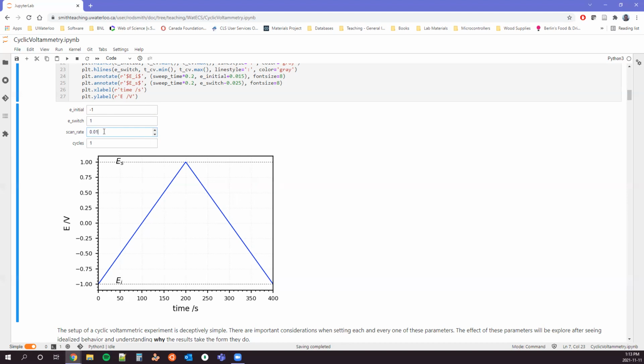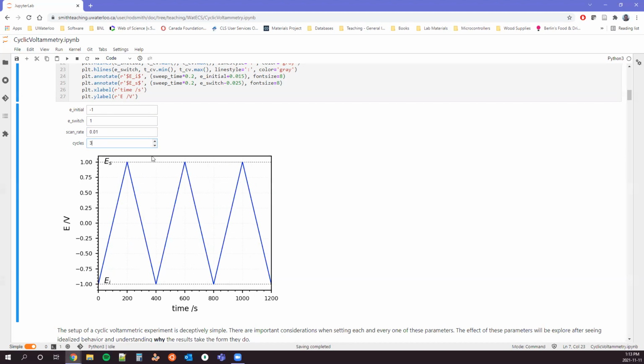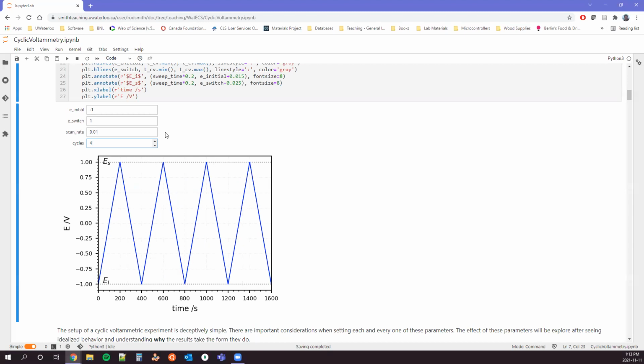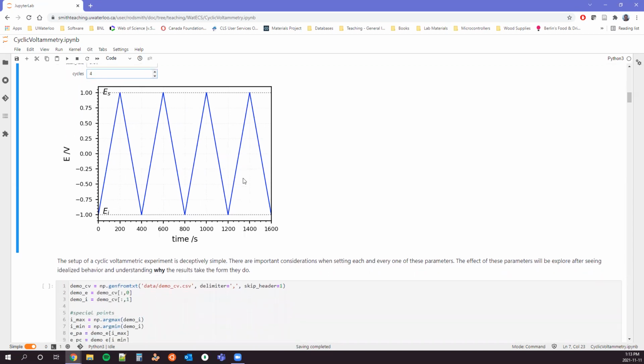Of course, that goes from having kind of millisecond sampling regimes out to, you know, stretching towards a day for your experiment, right? After that, we choose how many times we want to cycle it. We can add more and more. And really, like I said, your goal should be to find a steady state, right? You want to find the number of cycles where you're happy that you've reached a stable system so that when you're analyzing your results, you know that they're the meaningful results coming out of it.